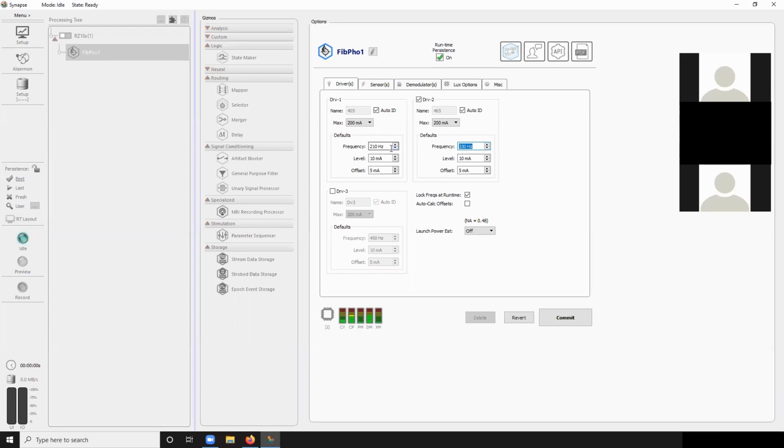And the way we do that is we pick up sort of the frequency content on the return signal. So the photosensor has 210 hertz, 330 hertz, 60 hertz, 120 hertz, a bunch of garbage on it too. And basically we pick out through this thing called lock-in amplification, how much of 210 hertz or how much of 330 hertz is on that return signal. And then you can monitor how much the amplitude of that signal is changing. So that's why we're driving these at different frequencies. And you can change that too. You can make these driver frequencies different as long as they're not multiples of each other or multiples of 60 hertz. The reason why you don't do multiples of 60 hertz is because that's what your wall power is at.